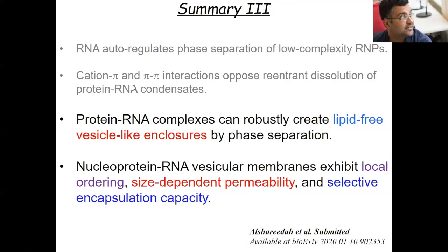One more question from Dieter. In your condensate coalescence experiment, does the velocity with which the condensates are approached affect the relaxation time? Yes, it doesn't really affect the relaxation time, it messes up completely with your experiment. So you have to do it in a very controlled way where you see the handoff.